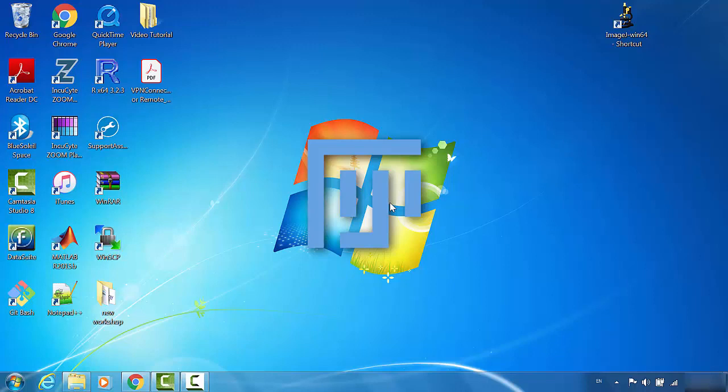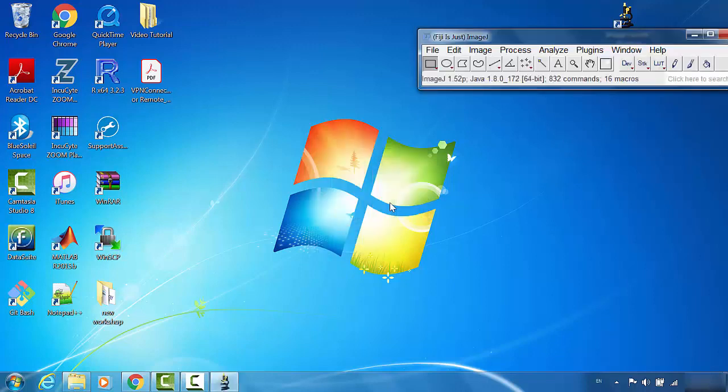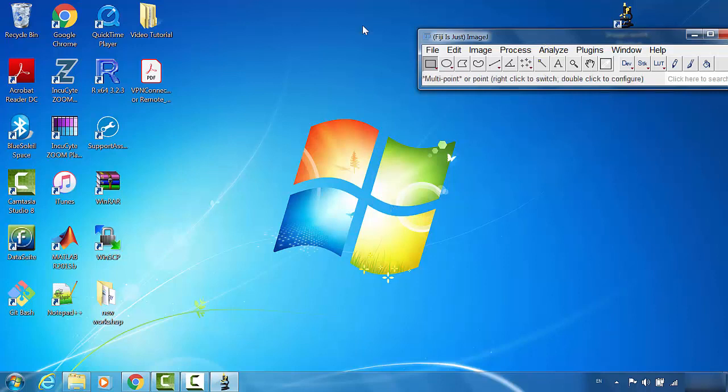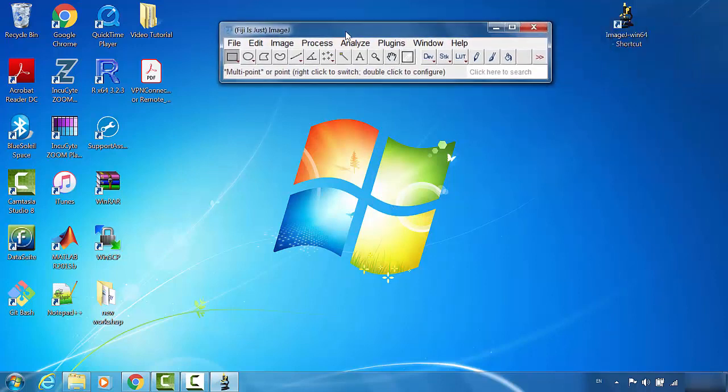But after that, it will be very fast. So this is the ImageJ window. That will finish the installation of Fiji ImageJ in Windows.